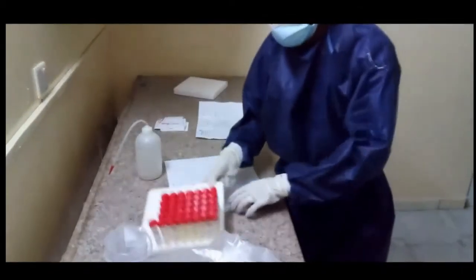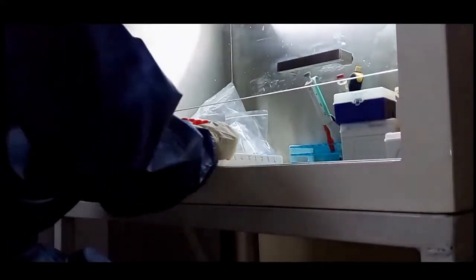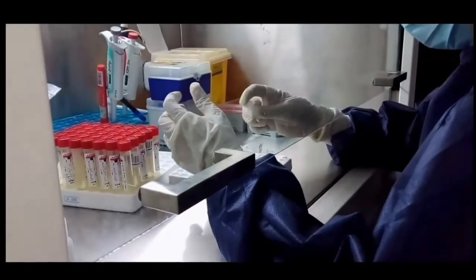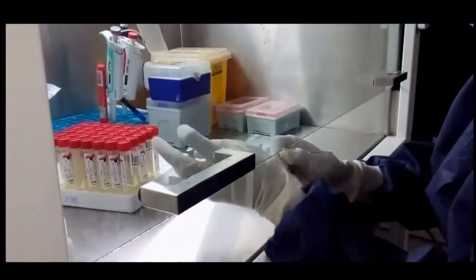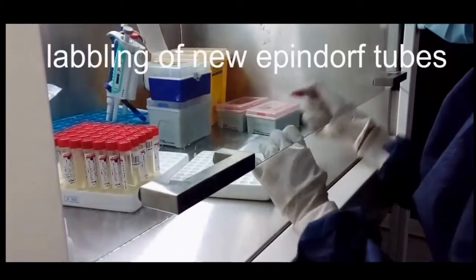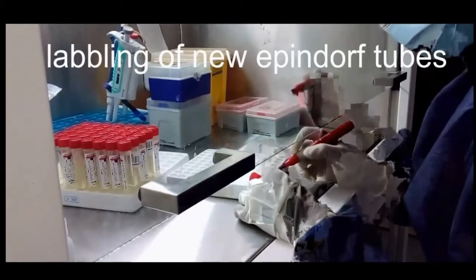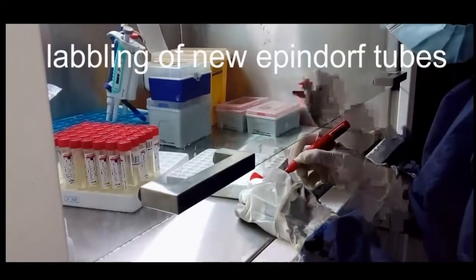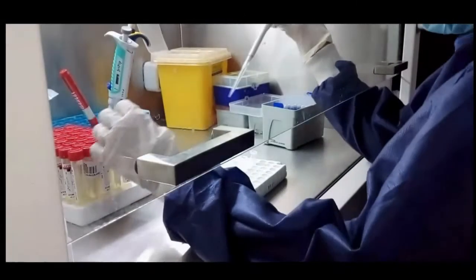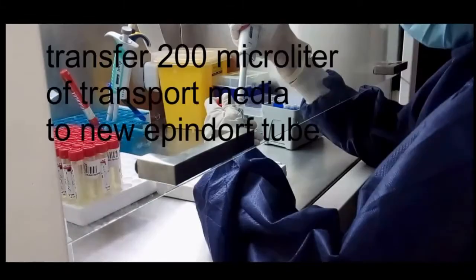Let's begin our work. Everything begins with registration. Insert the samples to the safety cabinet. Use Eppendorf microtubes. Label the Eppendorf microtubes. Use sterile filter tips and transport 200 microliters to the new labeled Eppendorf microtubes.